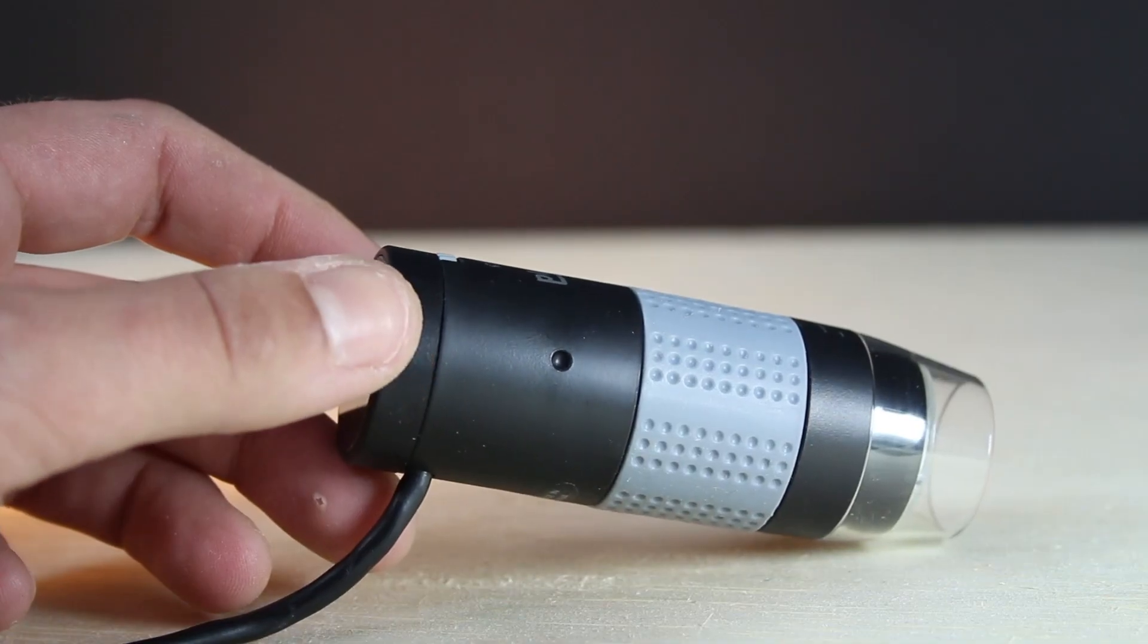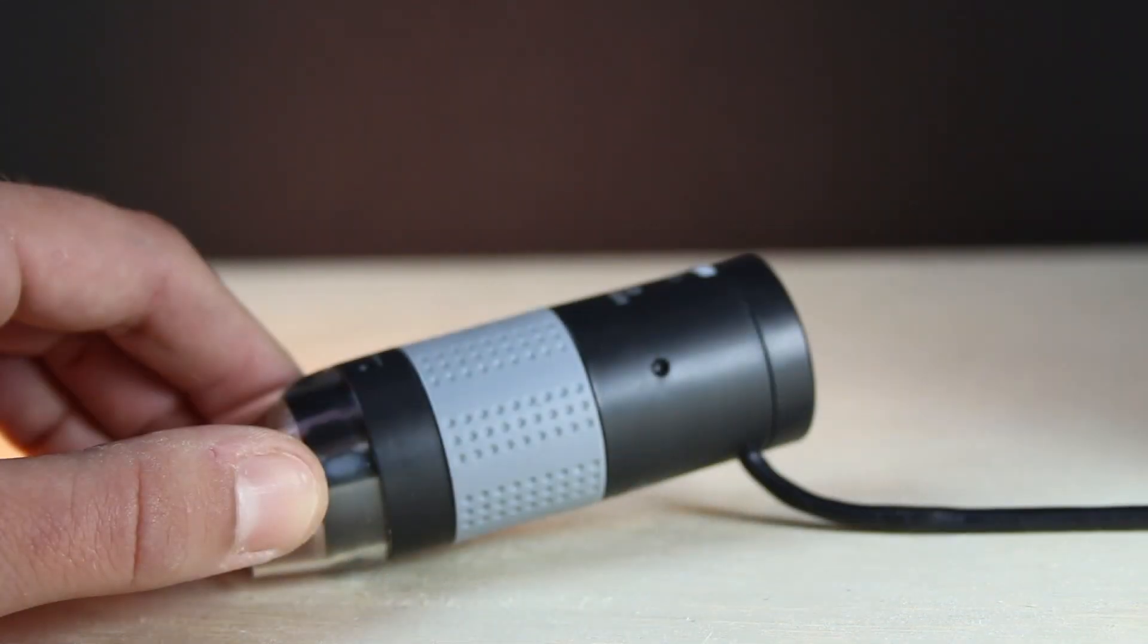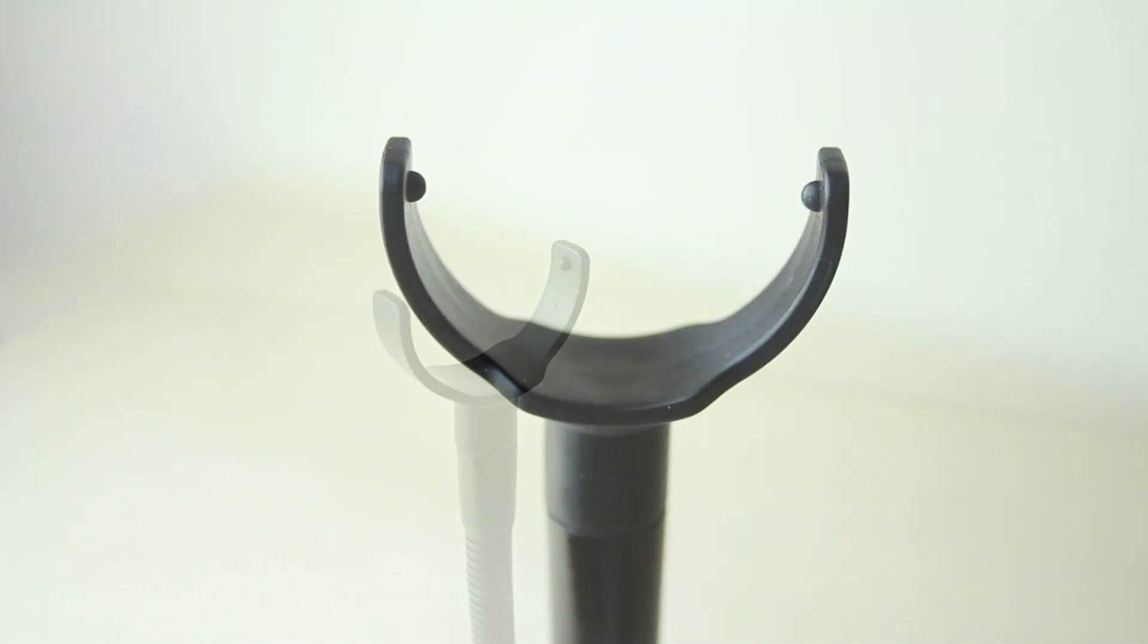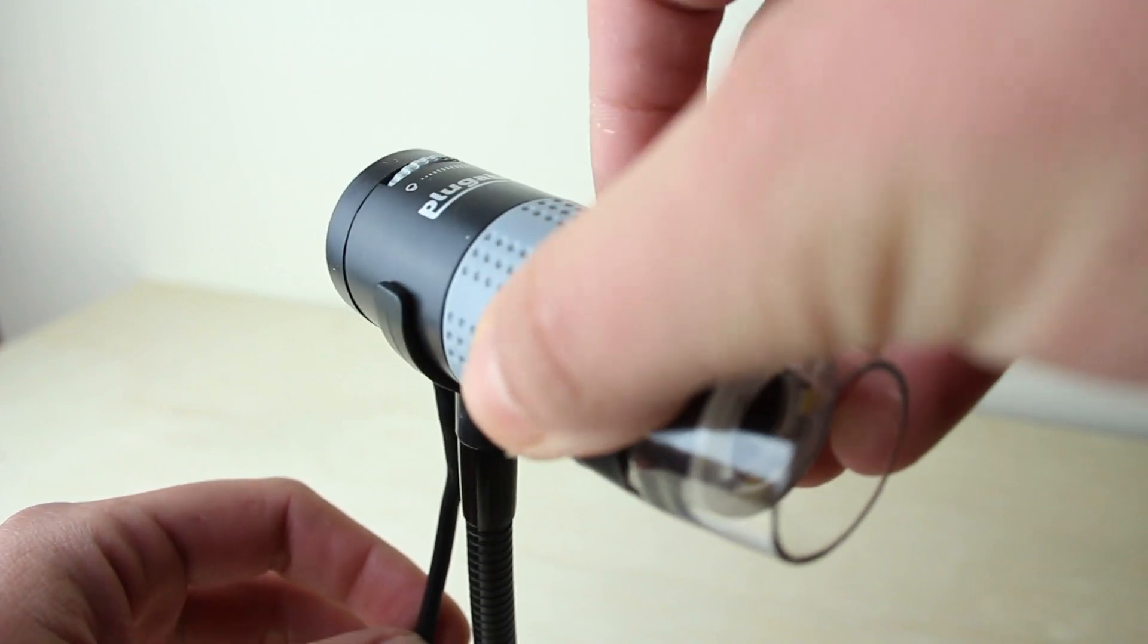You'll notice there are two small holes on both sides of the microscope, which have been designed to easily attach and detach to the microscope stand.